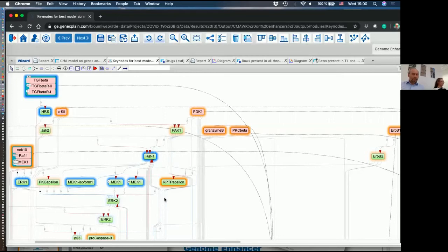Also, we have to mention from the very beginning all these input formats which Alexander showed. I do not think that other tools allow users to work in an easy and compatible way with so many different raw formats.